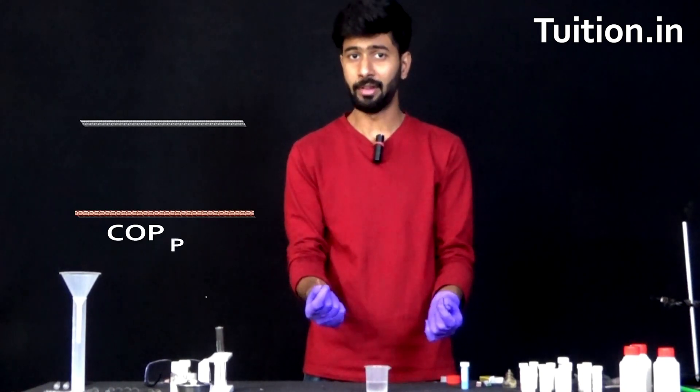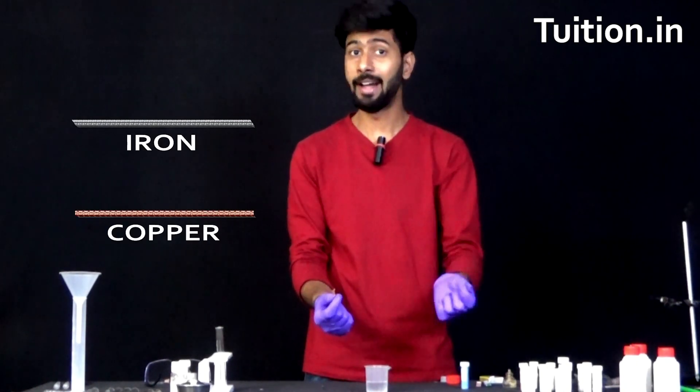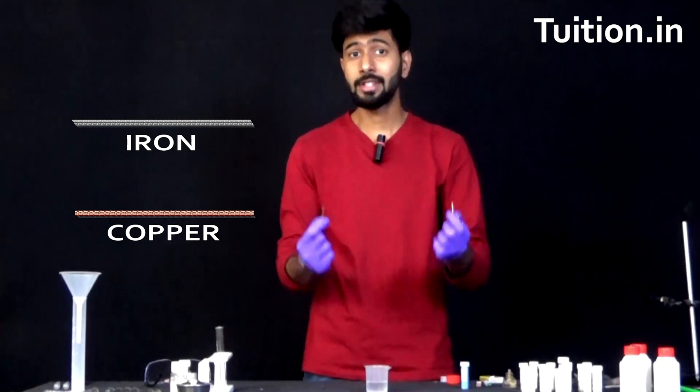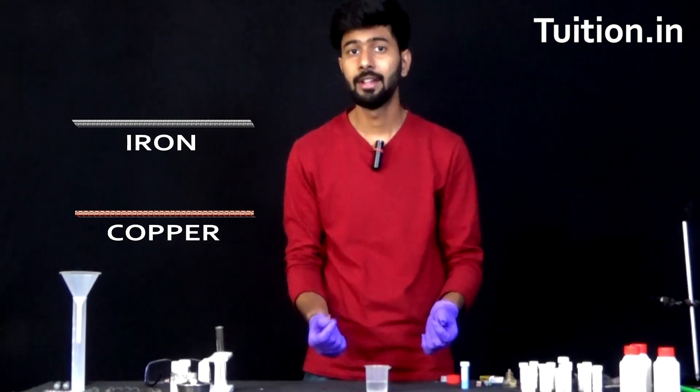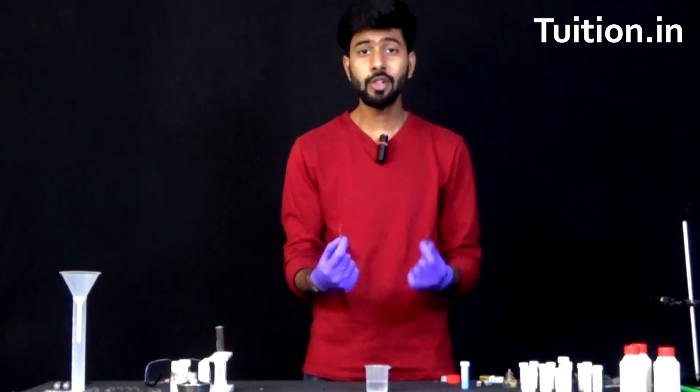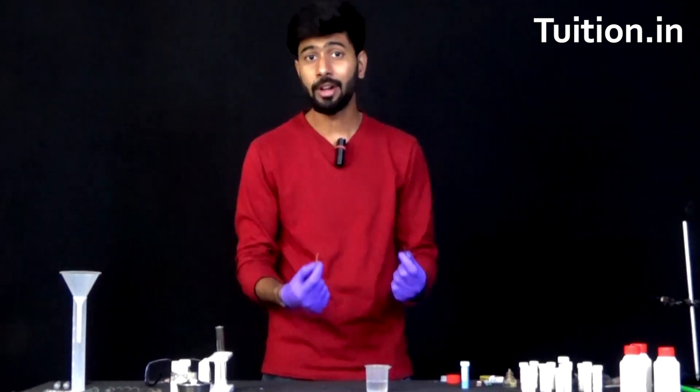In the right hand I have copper and in the left hand I have iron, two of the most common metals that you are going to see around in your day-to-day lives, but the question is which of these two is chemically more reactive?